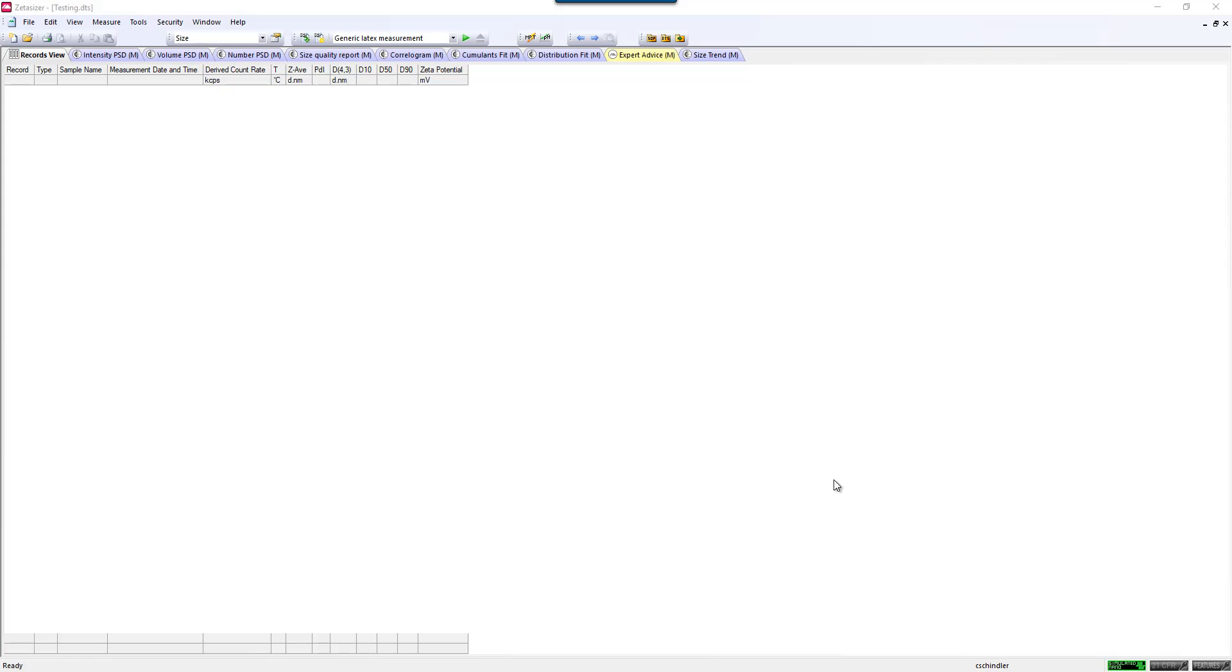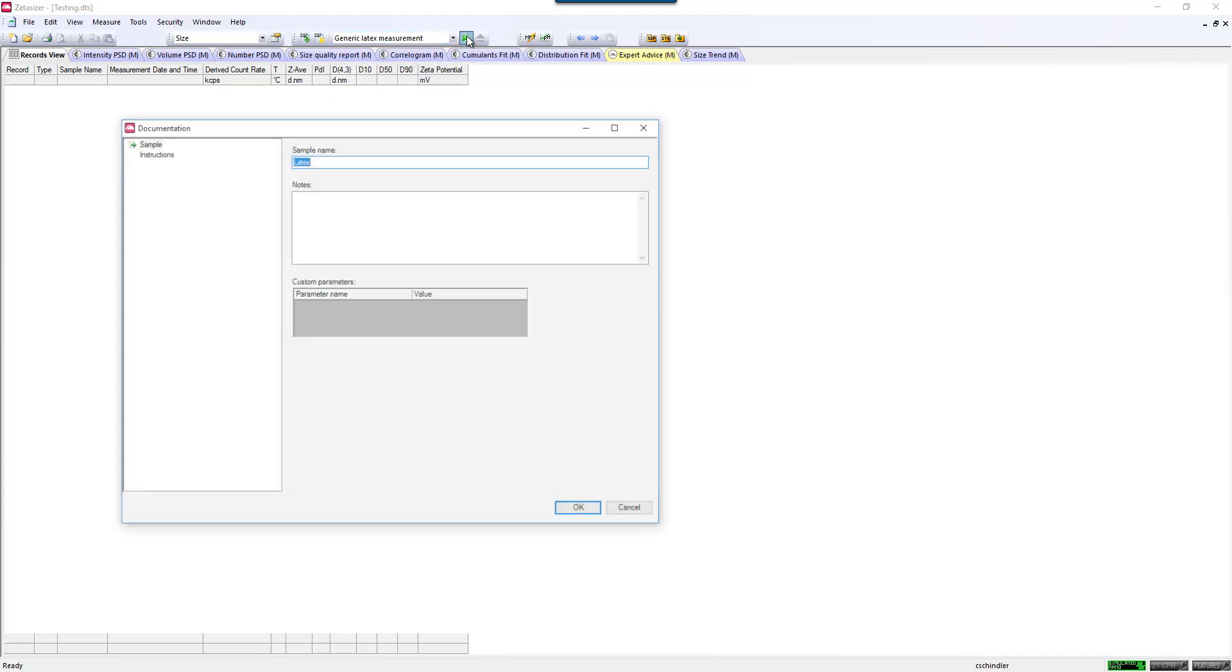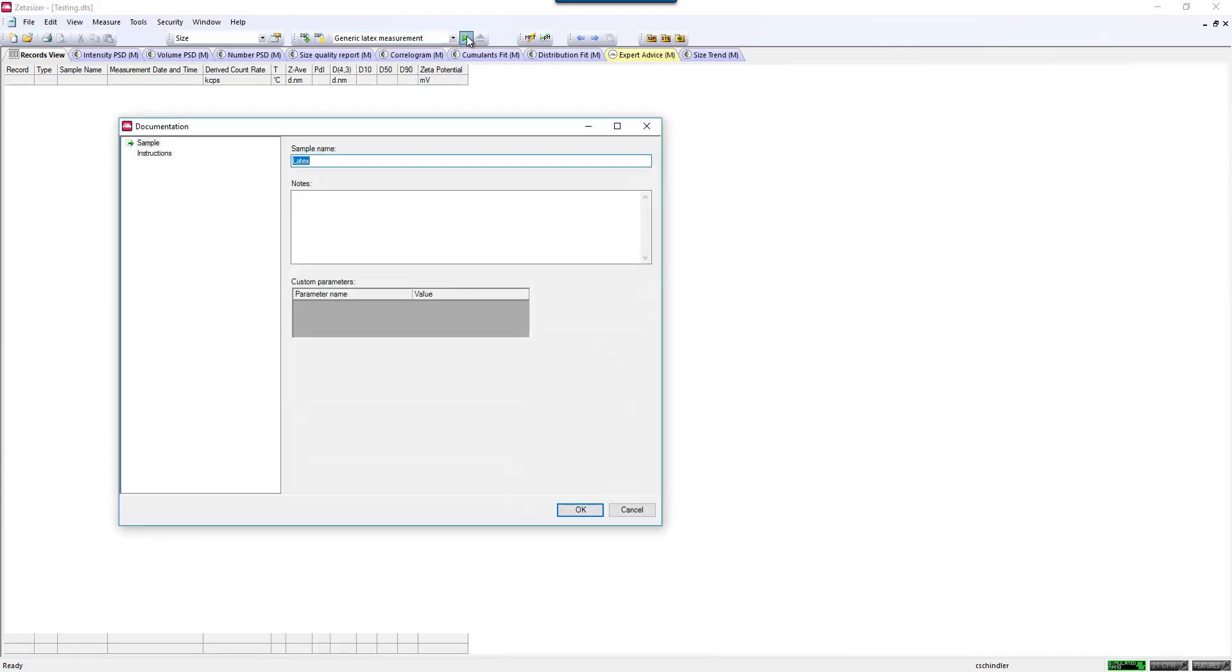Or you can write a new SOP manually each time you make a measurement. So it can be as simple as going up to this drop-down menu, selecting your SOP, and hitting Play.